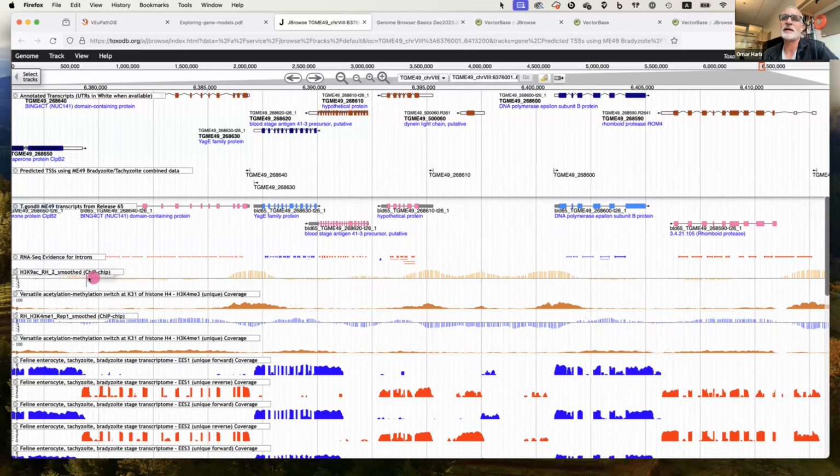So for example, I can take a look at this histone 3 with an acetylation at the 9th lysine, H3K9 acetylated. You can see there are peaks in different locations. If I try and see where these peaks are, there's a gene going from right to left and a gene going from left to right, and there's this really big wide peak in between them. Let's move down a little bit more. It looks like there may be a small peak right here, upstream of this gene. Here's another peak upstream of this gene. There's another peak in here, upstream of this gene. Here's another gene, and it looks like there's a peak right upstream of it.